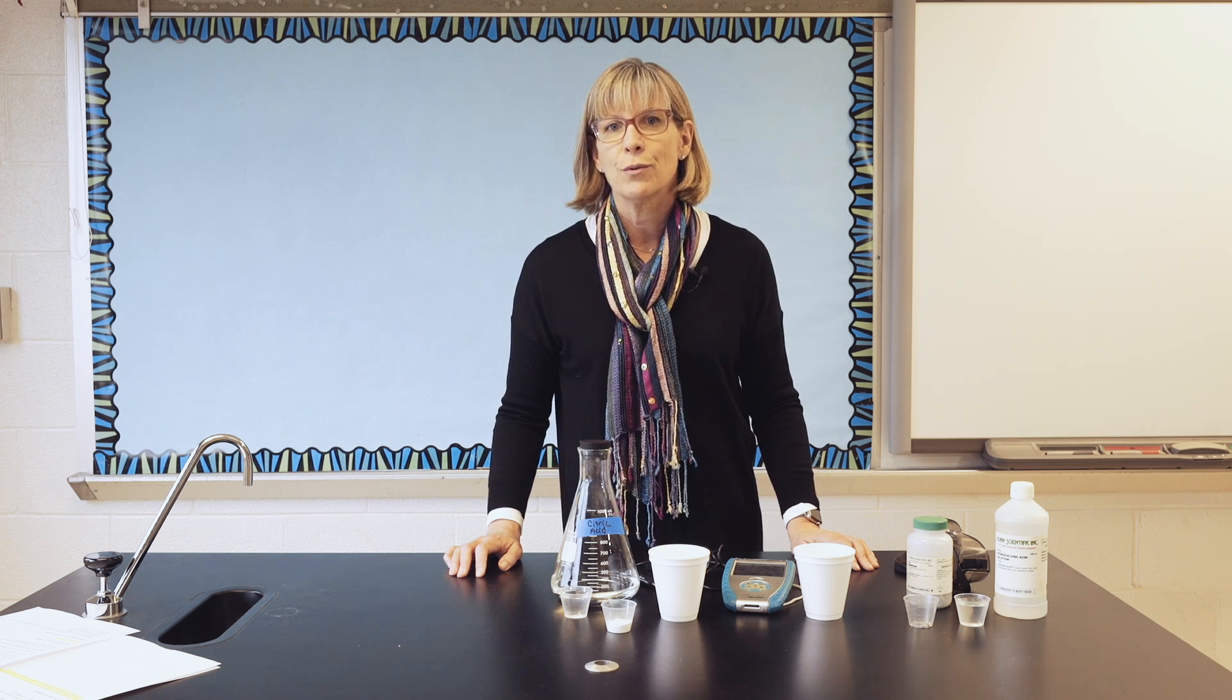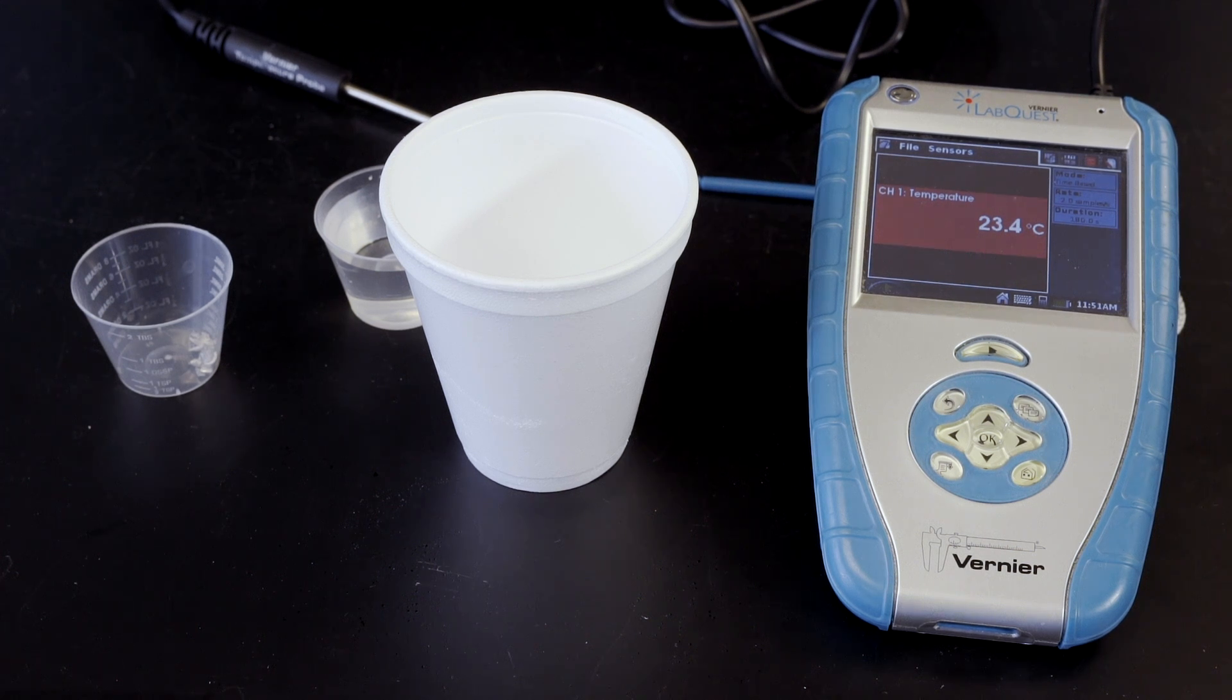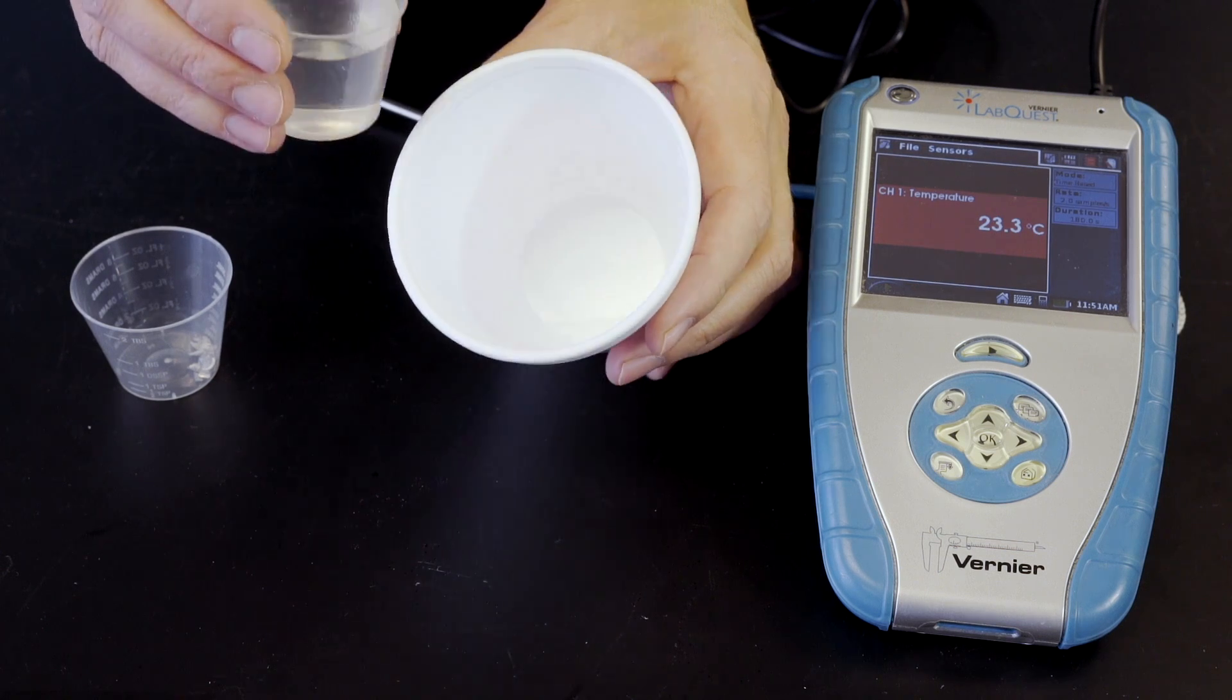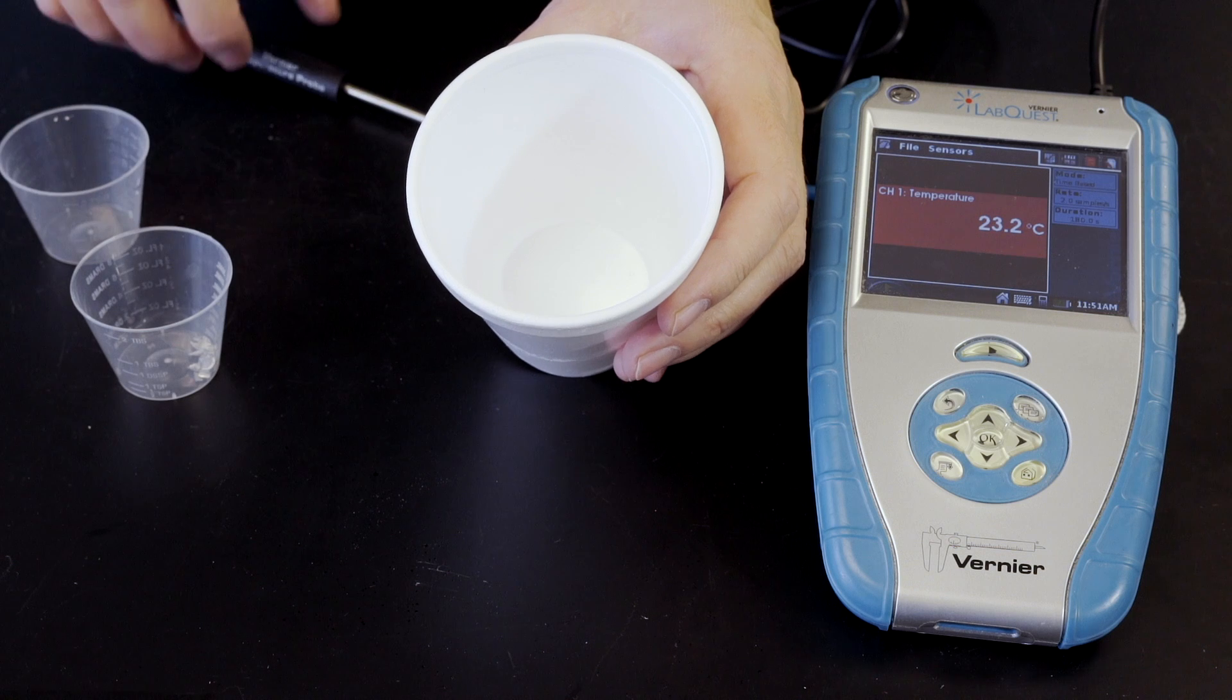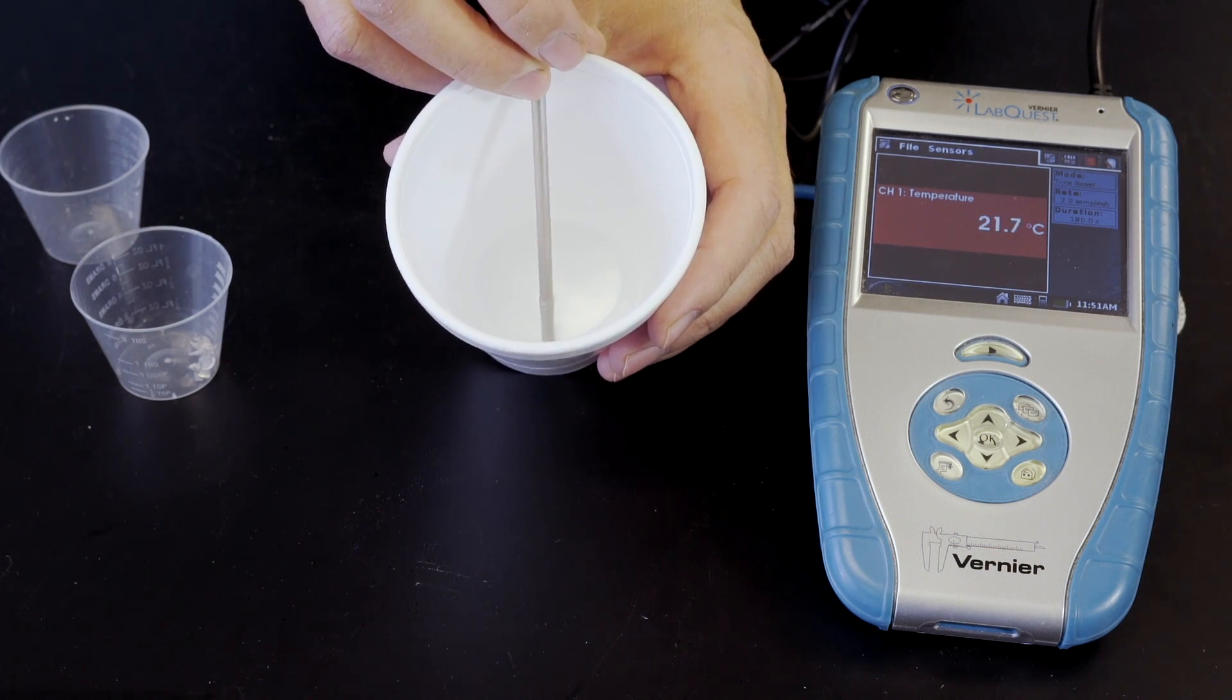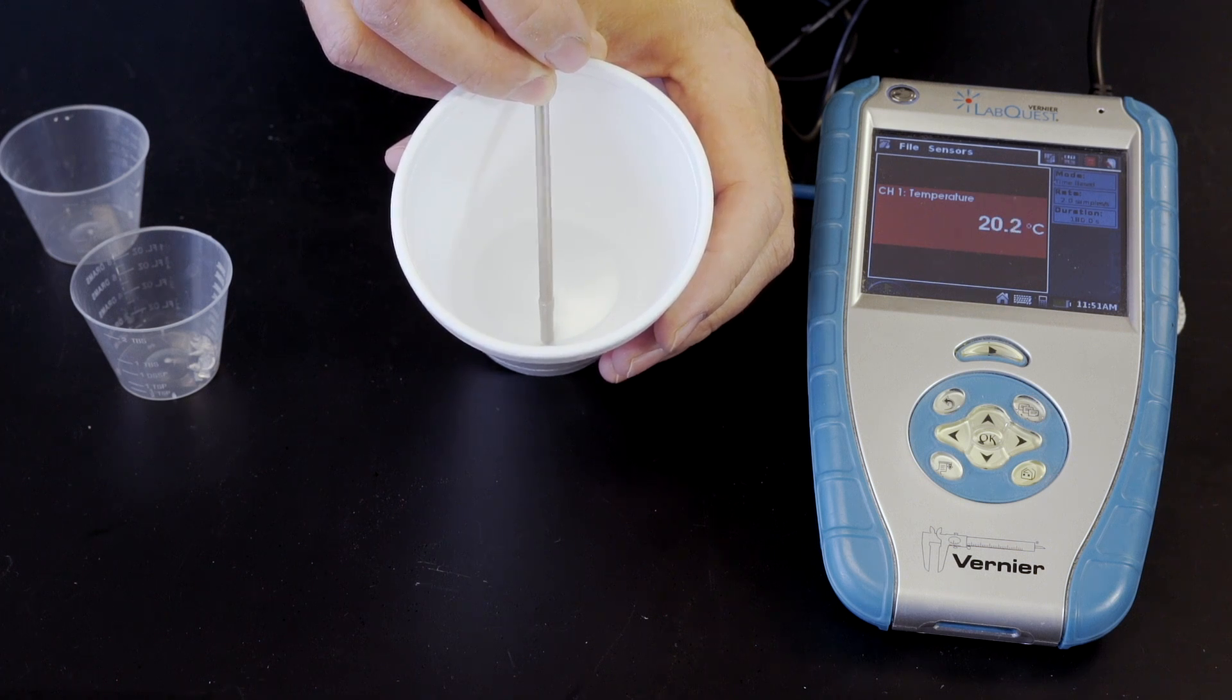Now we'll do reaction two. In reaction two, 30 mLs of hydrochloric acid is added to the cup. The temperature probe is placed in the cup. Once the temperature equilibrates and stops changing, we'll begin recording.